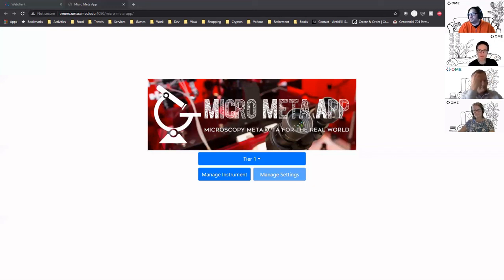So in my perfect world, whenever you load an image on OMERO, you could already select from OMERO directly which microscope you used, and load the image. It extrapolates the metadata already, and during the uploading phase, you get asked, okay, add this more metadata because it is missing.